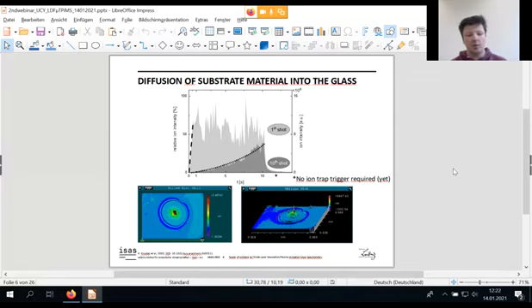Yeah, and the cool thing about this sandwich structure was that we used a very, very high concentration. We shot on the copper surface, and we were able to receive an ion response even after the 10th shot, which has two sides. On the one hand, you would say, okay, you're not absorbing anything, we have a high concentration. That's the one side. The other side is, why do we still have a signal?